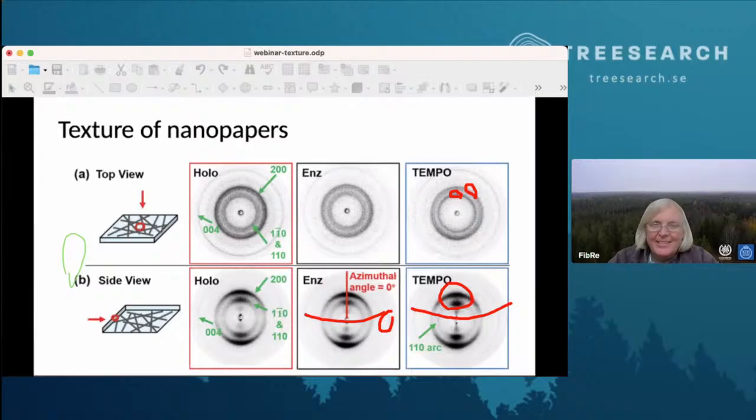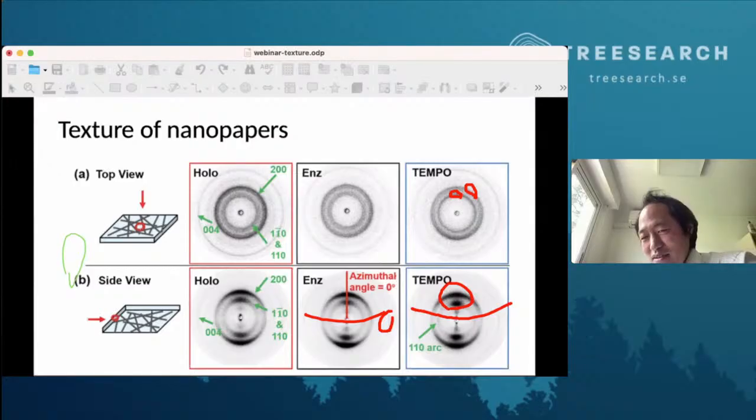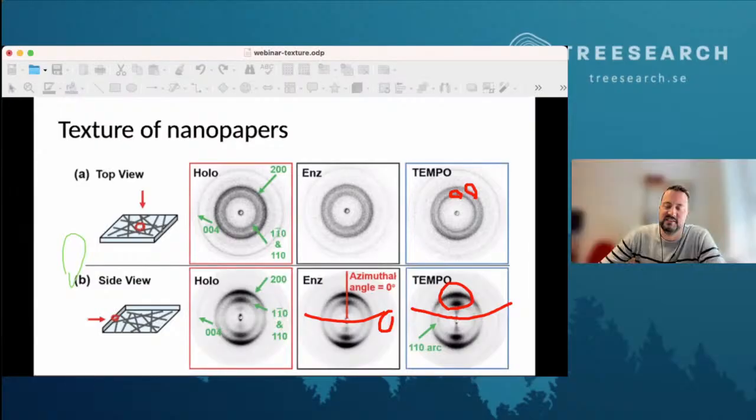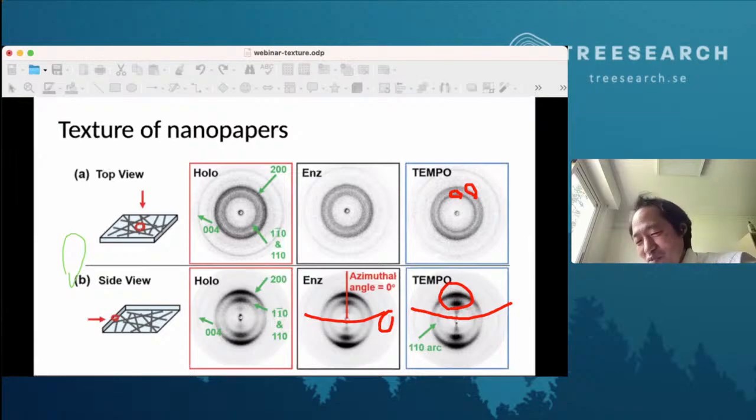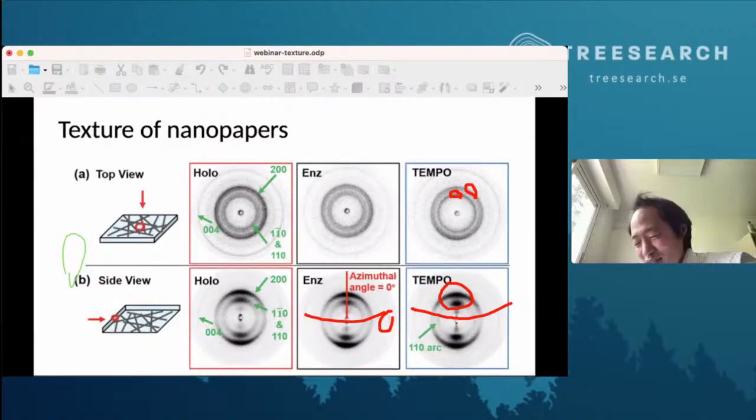Nice. But dwelling on that topic, if one heats under X-ray radiation, would a restructuring of the polymer itself show up? Yes, in a sense, I think so. But you might not want to do that at a synchrotron because you will hurt the sample, or you have to change the place where you take the scattering. So then basically there are experiments to discuss at some future occasion. Yes, that sounds very good.